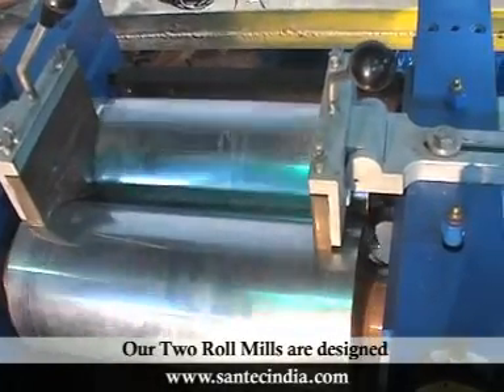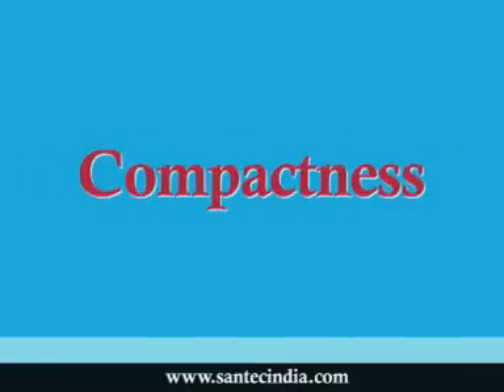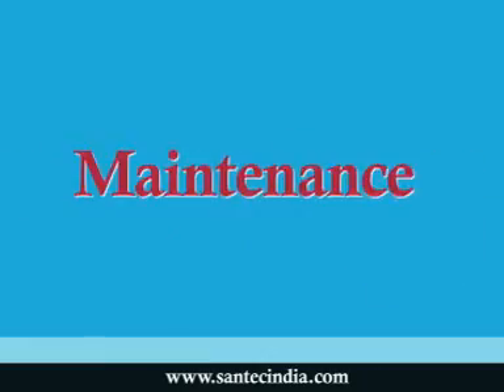Our two roll mills are designed with many user-friendly features like durability, compactness, ergonomic features, ease of mobility, user-friendly operation and maintenance, and economy.